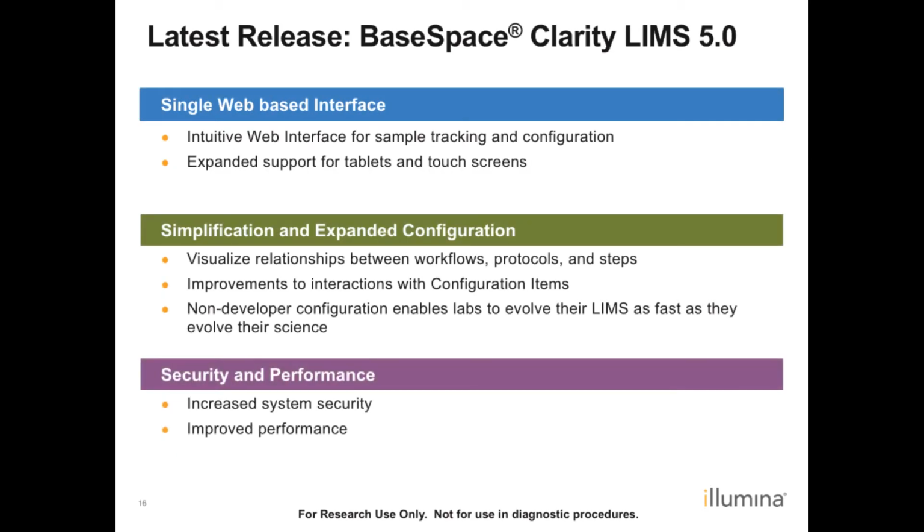Our most recent release is BaseSpace Clarity LIMS 5.0, and in this release we have a single web-based interface that allows you to easily learn, use, and teach new people to use the LIMS. We've expanded our support for tablets and touchscreens. We've simplified and expanded our configuration. This configuration is non-developer configuration. It doesn't require a special skill set or learning a computer programming language. This allows your lab to evolve your LIMS as fast as your science is evolving.